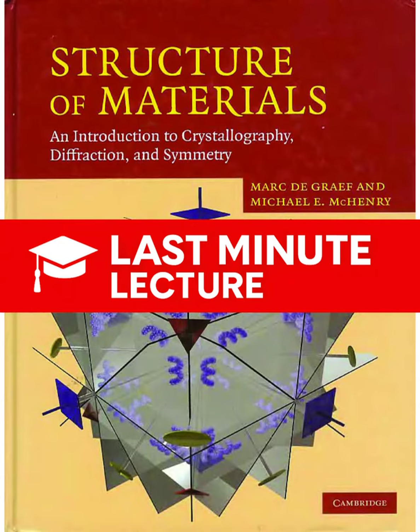And what's the profound takeaway from that simple analogy? It's the crucial insight of the reciprocal relationship. The diffraction pattern is the image of the reciprocal lattice, not the real space lattice.